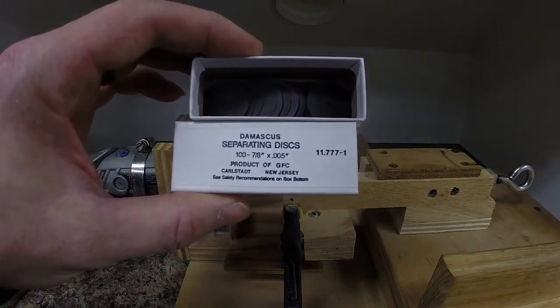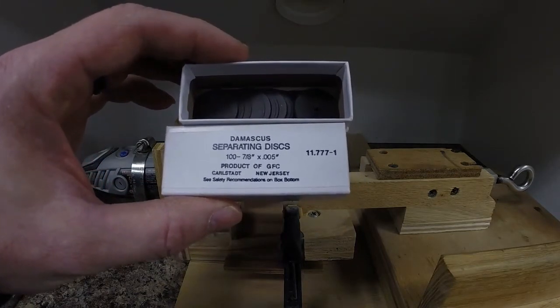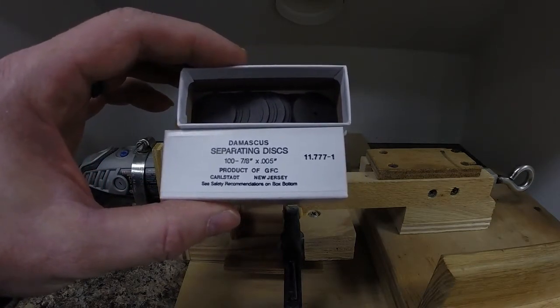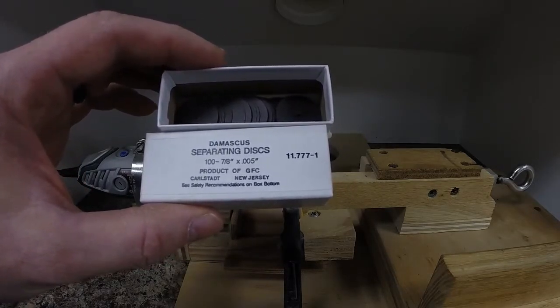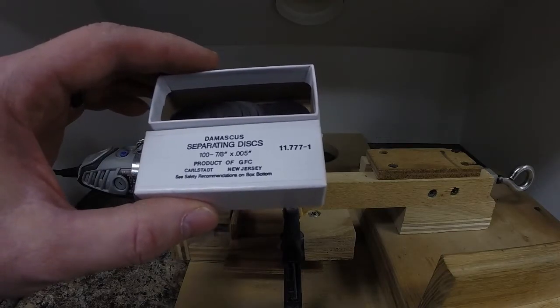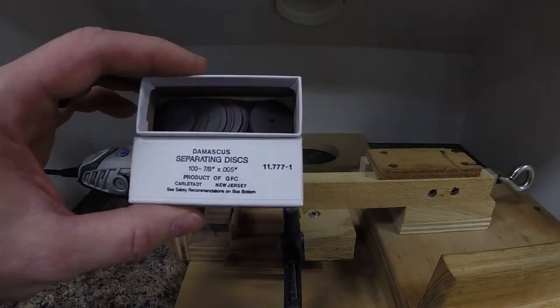It's a matter of preference which ones you use. I use both but most of the time I stick with the separating discs. I feel like they don't flex quite as much as the metal discs when you're cutting, resulting in a little bit more square cuts on your sections.